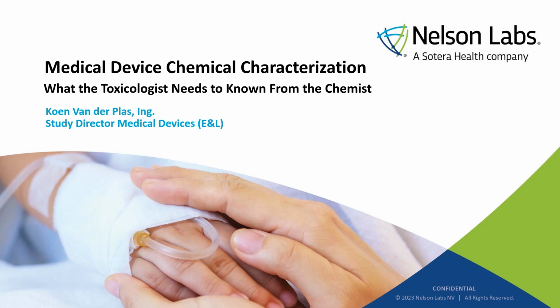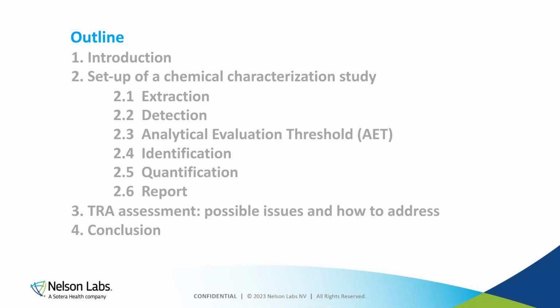So good day, everyone. Today, I will give a presentation on medical device chemical characterization, what the toxicologist needs to know from the chemist. And my presentation will actually highlight how you come to the chemical data in the first place a toxicologist can do his or her risk assessment on.